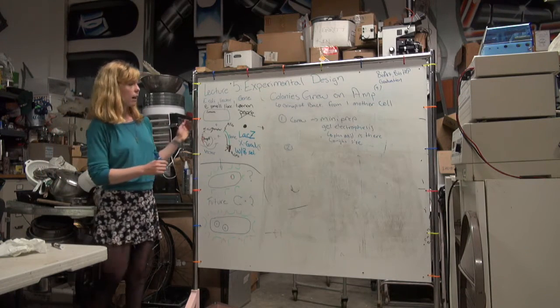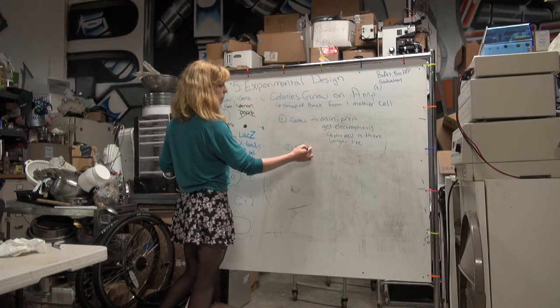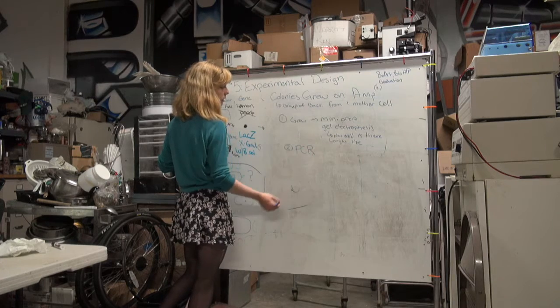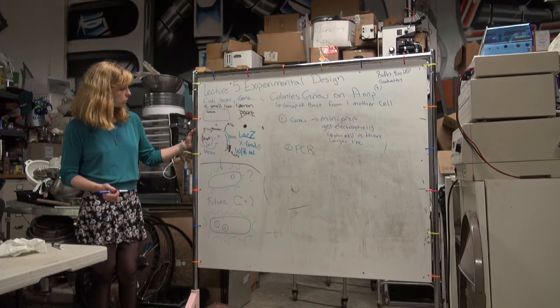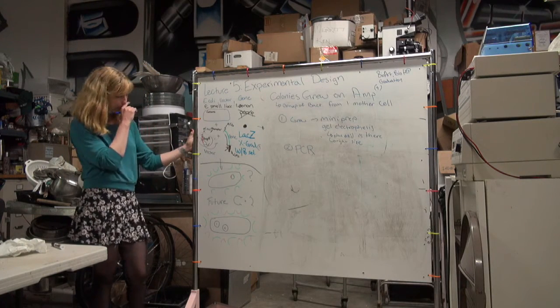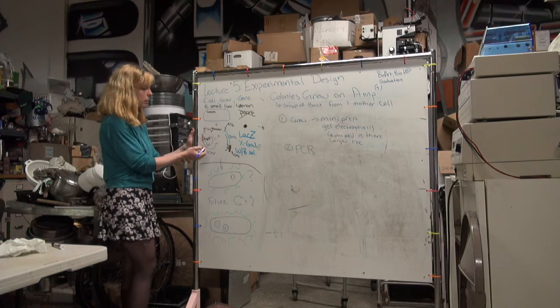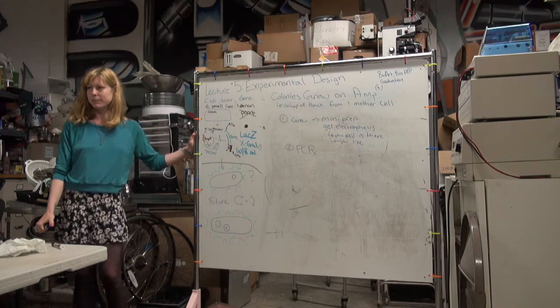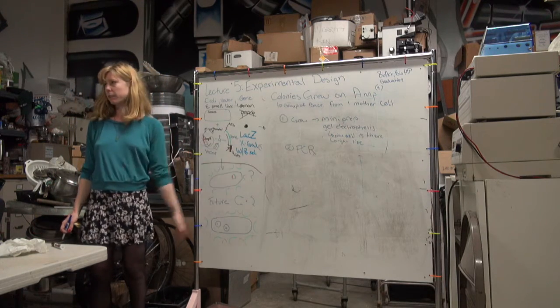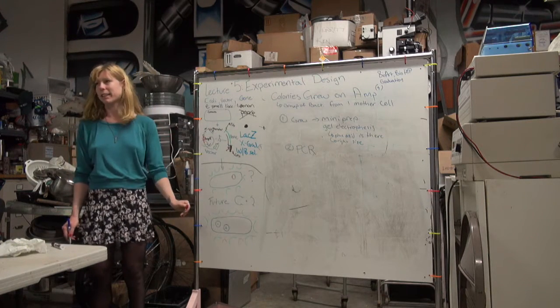Okay. The second thing that we might want to do is PCR. We'll probably do PCR of either our AMP gene, or any part of this that might distinguish this plasmid. It might be convenient to make primers that go here and here around where we might insert our gene of interest, so that we'll have those ready for later down the pipeline, and we want to make sure that the gene of interest also got in there because we do this exact same process, right?